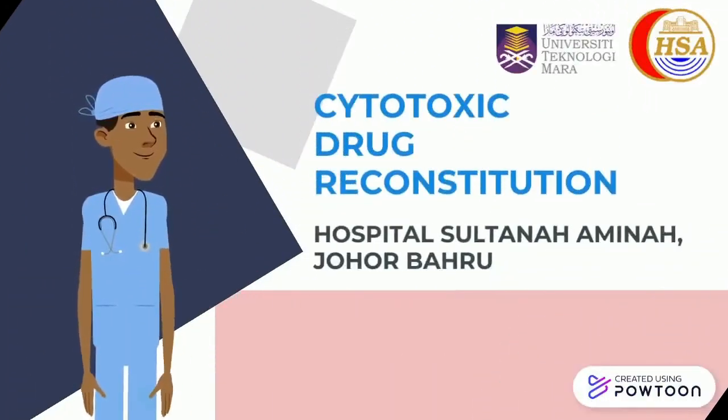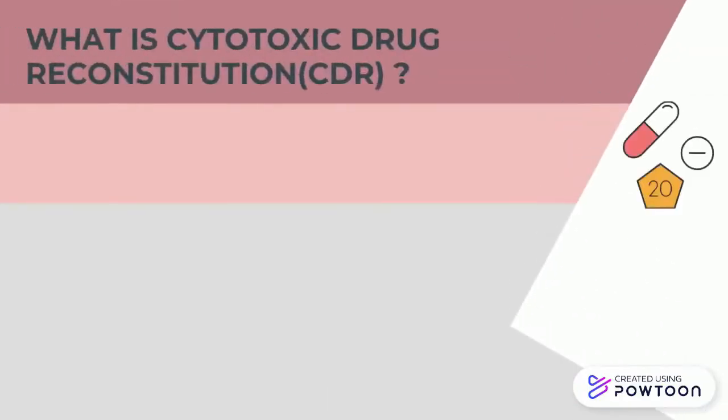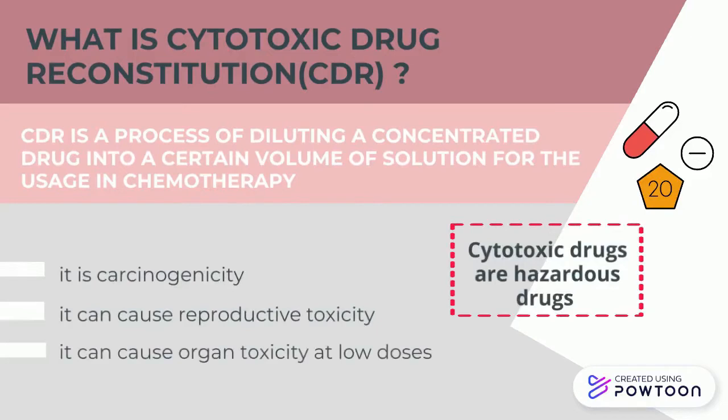Cytotoxic drug reconstitution. What is cytotoxic drug reconstitution? It is a process of diluting a concentrated drug into a certain volume of solution for the usage in chemotherapy. It is also a hazardous drug.